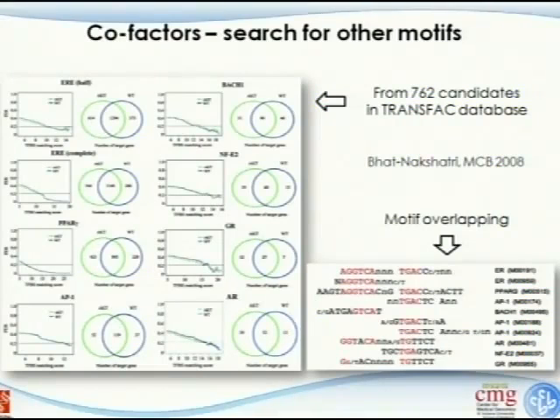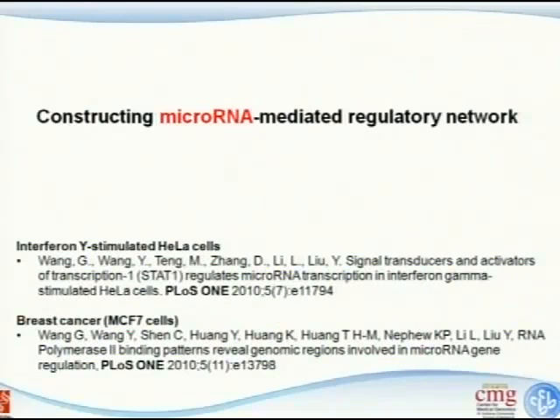So very simple strategy. Everything just based on what I talked about today. Nothing fancy. Based on the position weight matrix, you got the enriched regions, got those sequences, calculate the matching score, adjust your threshold, and see whether your enriched region will beat the randomly selected region. That's all. Very simple strategy, but this can help us to get there.